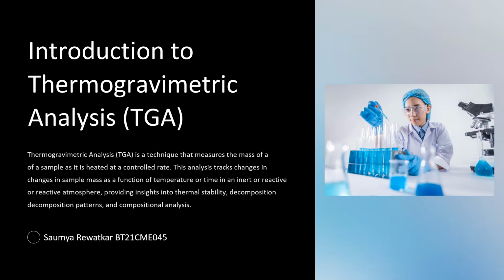Hello everyone, my name is Soumya Revatkar and my today's presentation topic is Introduction to Thermogravimetric Analysis. Thermogravimetric analysis is an analytical technique used to measure the change in the mass of the substance as a function of temperature or time under the controlled atmosphere.